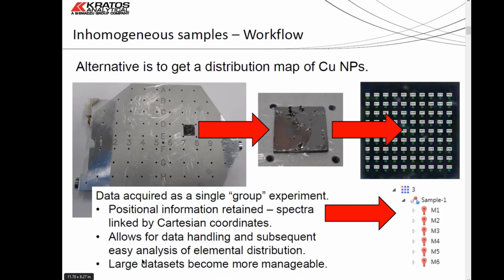Apologies to start with, because most of what I'm going to be discussing today is done on the Axis Nova, and I guess most of you don't have a Nova. It's my favorite instrument. We can go into that later, but this is obviously not a Supra or Ultra sample bar. This is a Nova Platinum, and my talk lends itself to that, because in the Nova you can put really big samples into it.